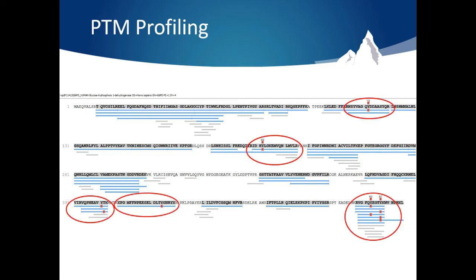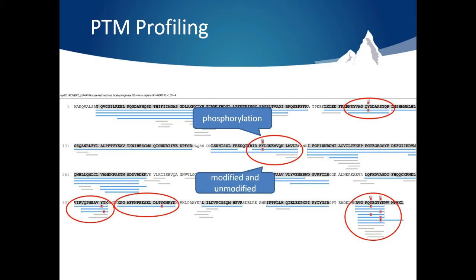PTM profiling works with all PTMs, but in this example we will look at phosphorylation. In this protein, there are several phosphorylation sites. However, unmodified peptides were found at those positions as well.